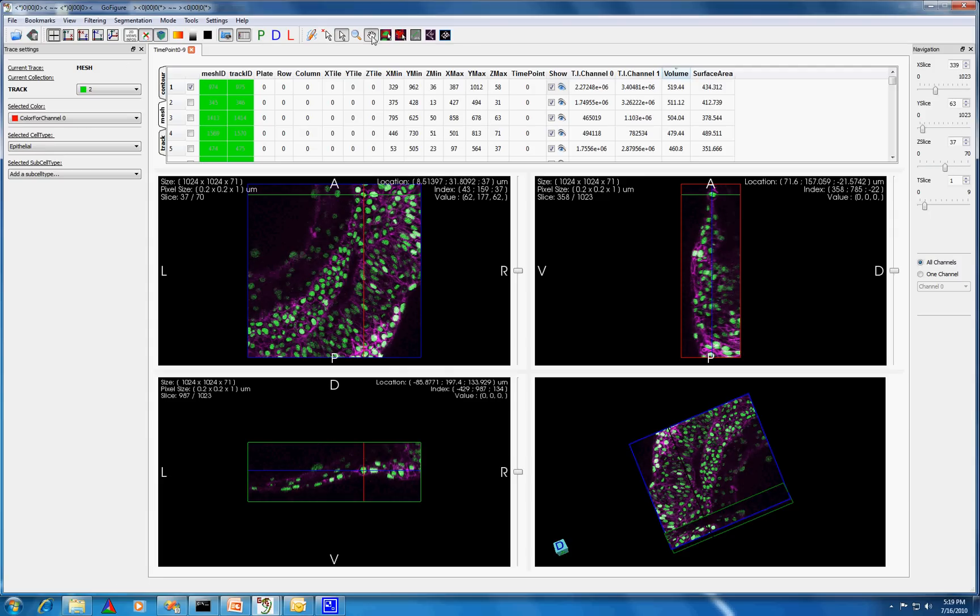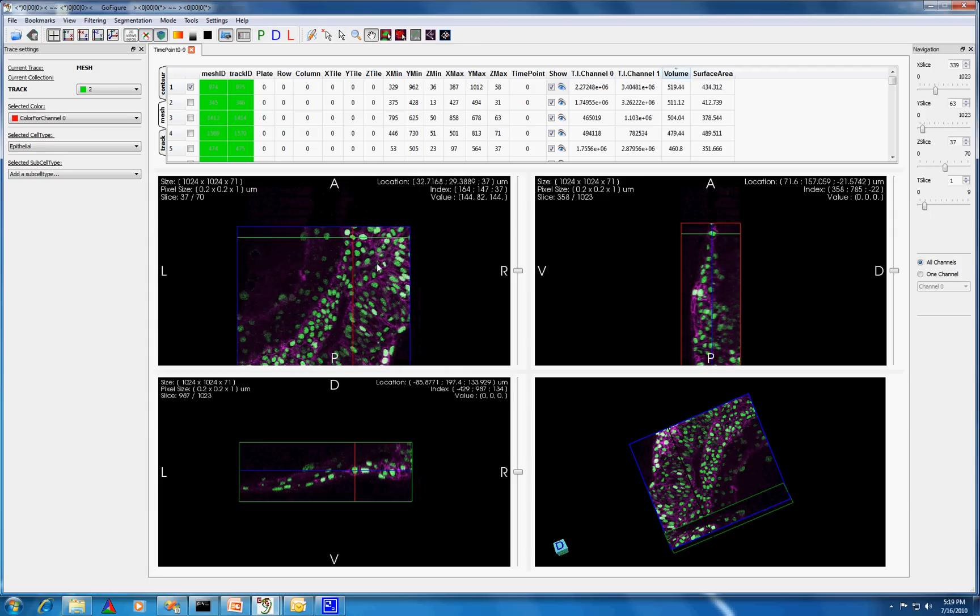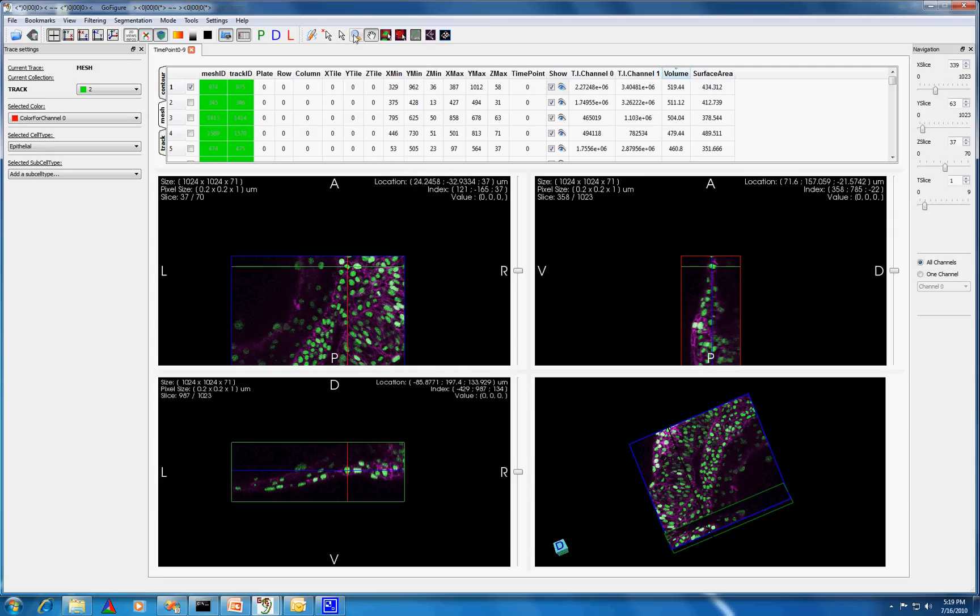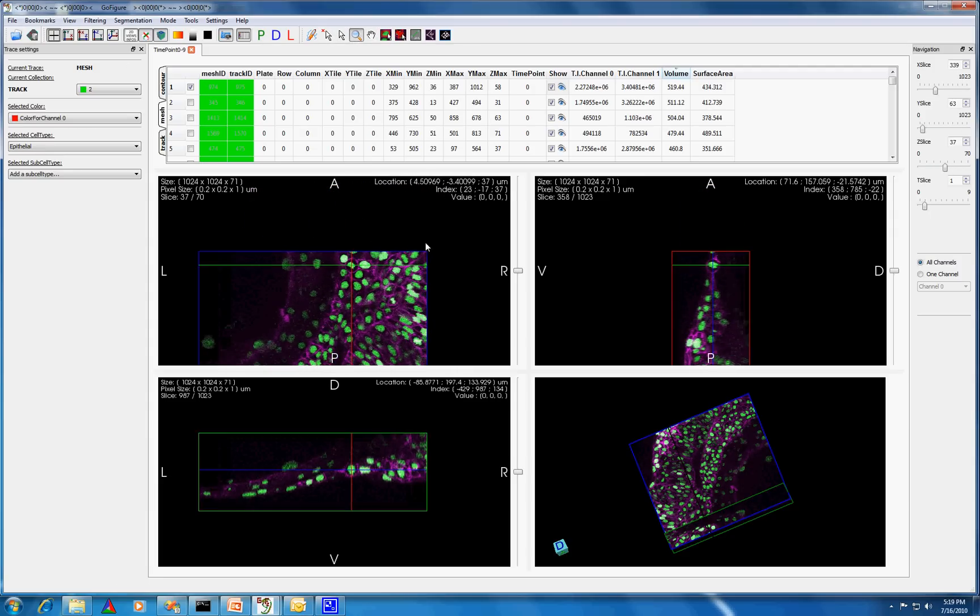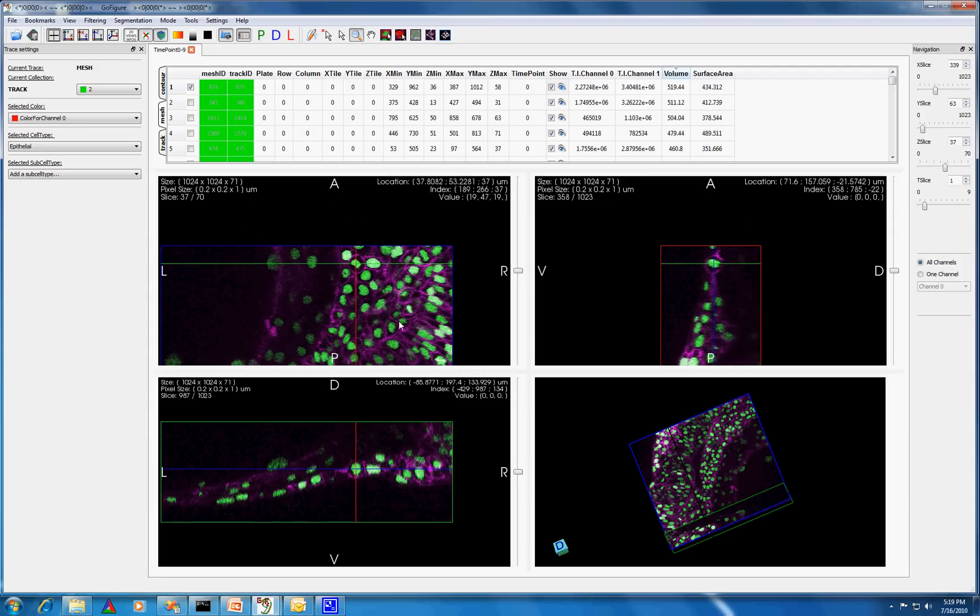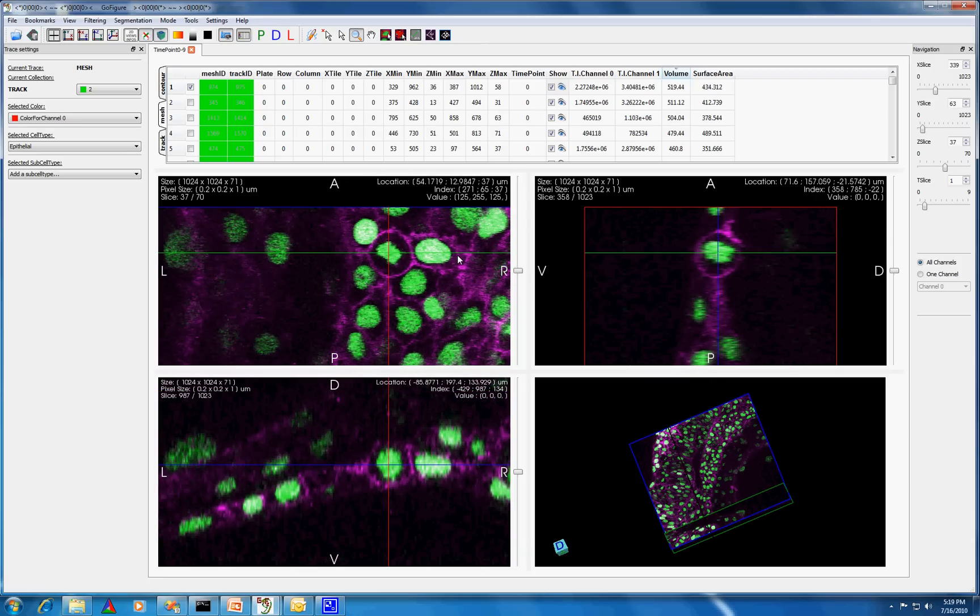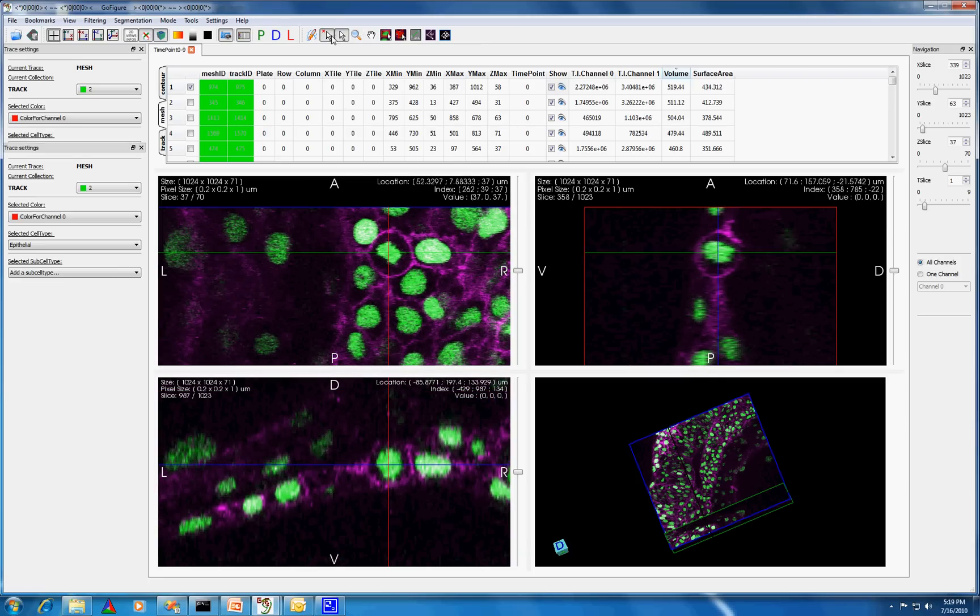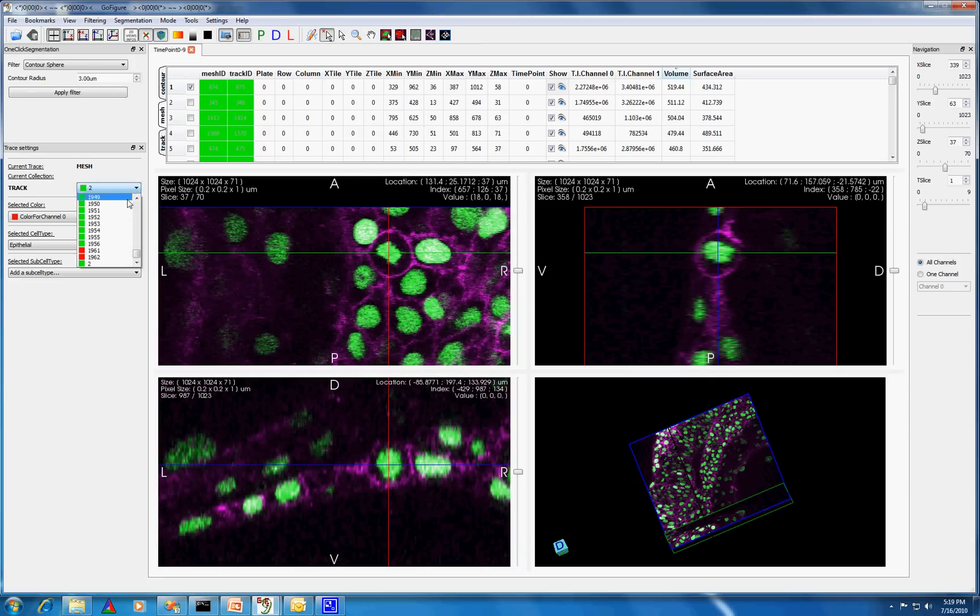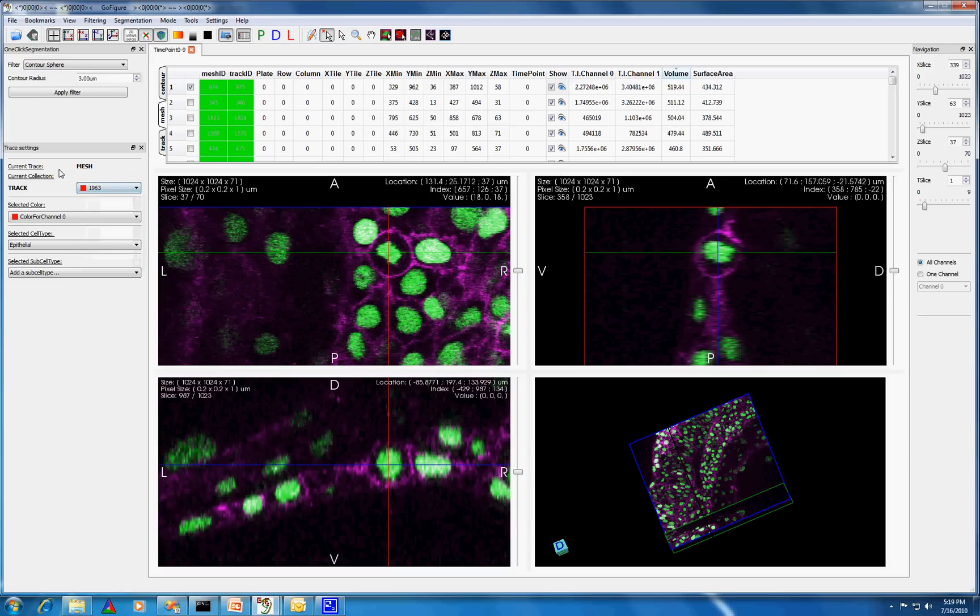I'll center the display around this cell and zoom in on it for a better view. I want to track this cell, so first I'll create a track. And all the meshes created for this cell at each time point will automatically belong to this track.